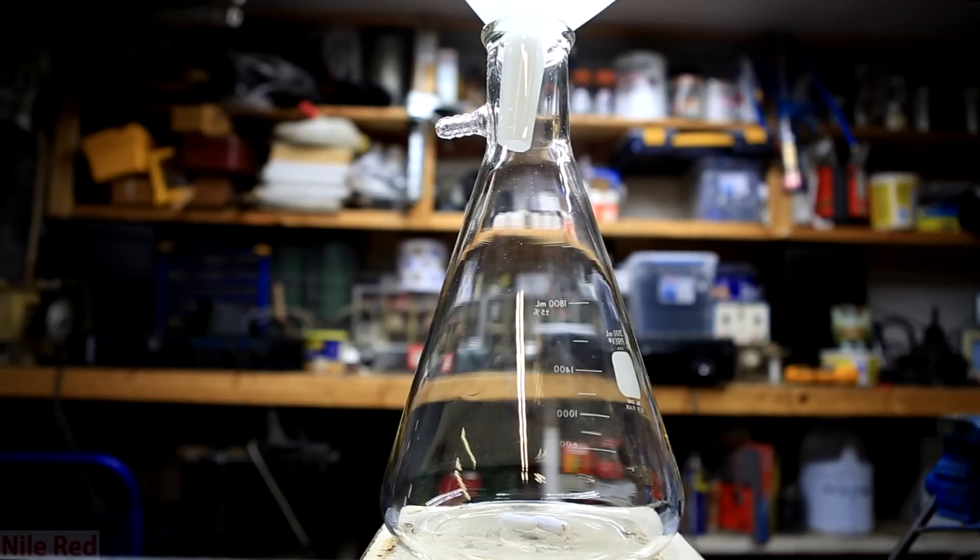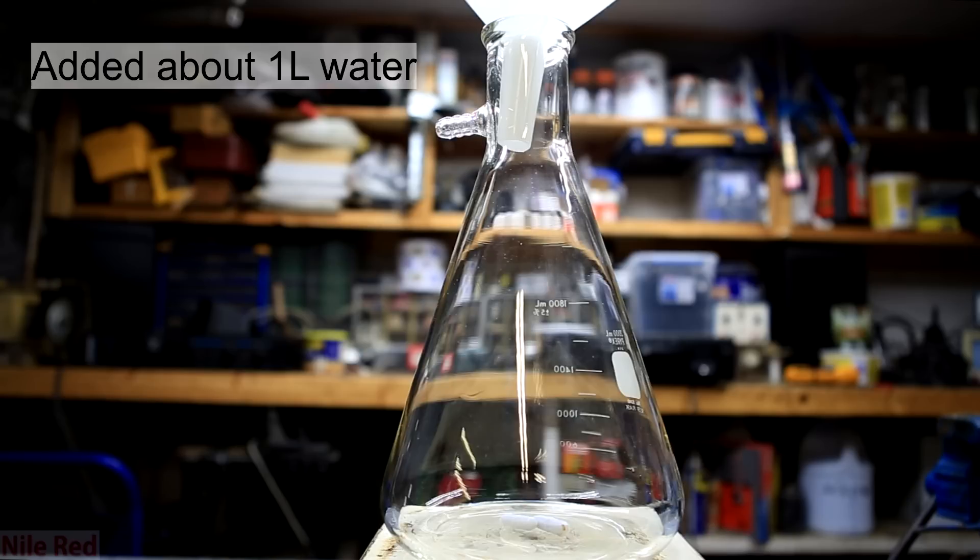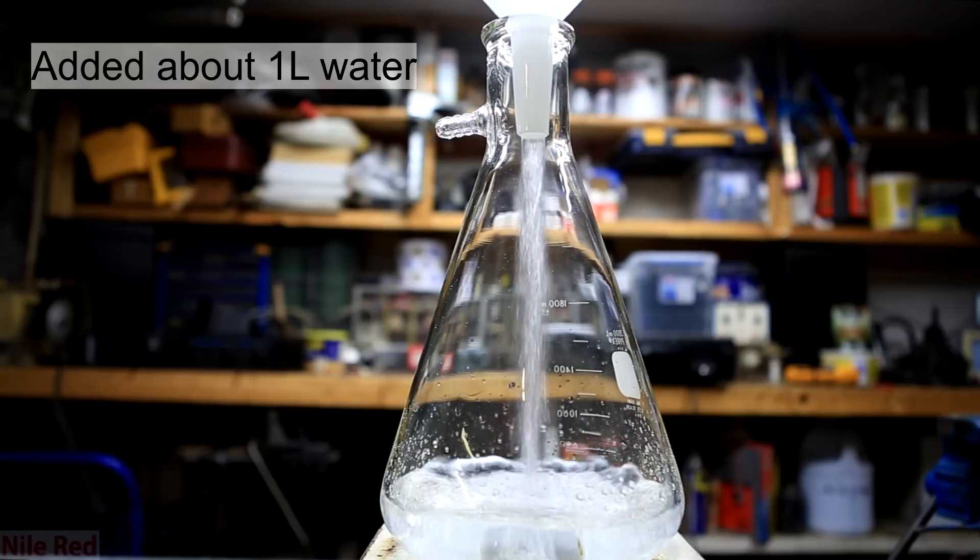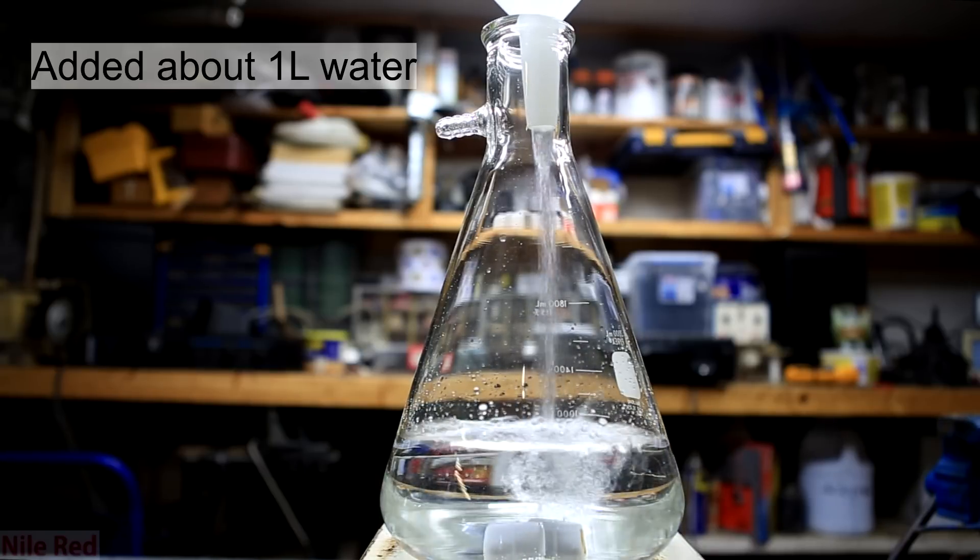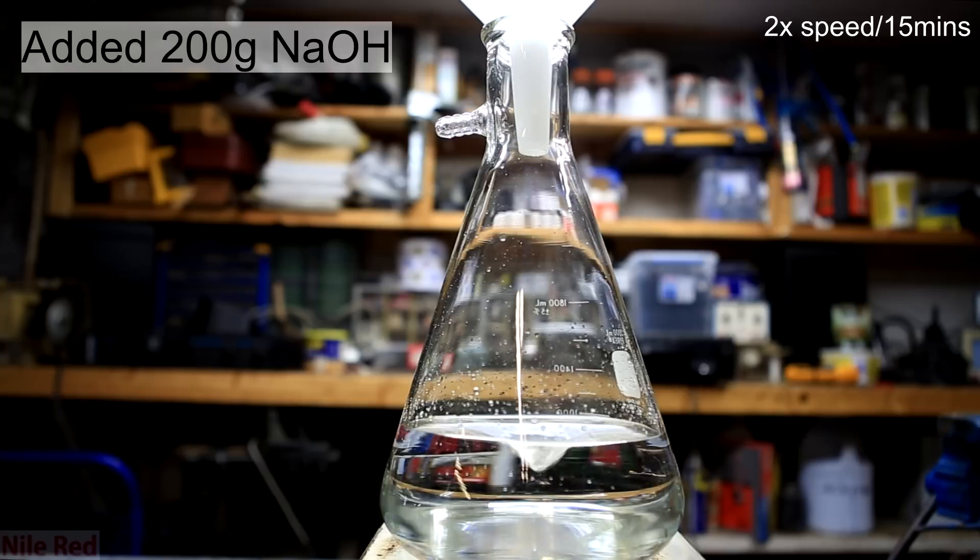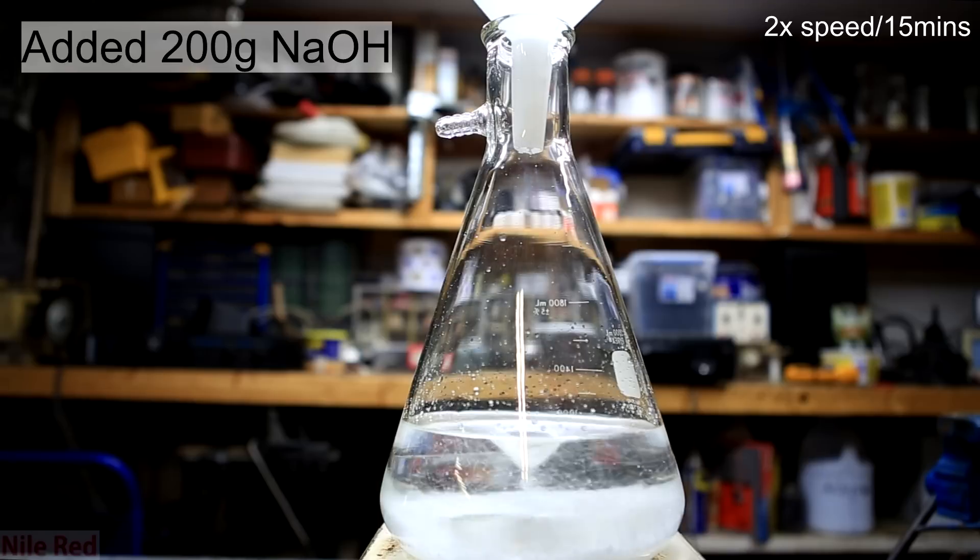Now to make the base bath, which has a procedure that's a little longer and significantly more costly. To a suitably large container was added one liter of distilled water. To this was added about 200 grams of sodium hydroxide.